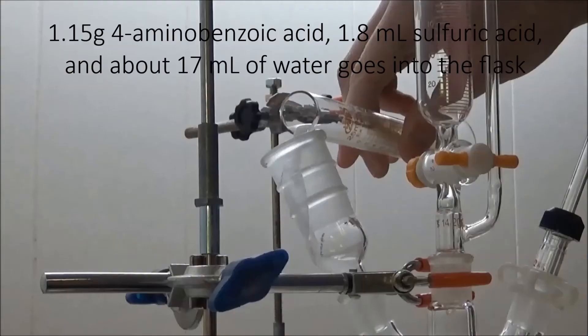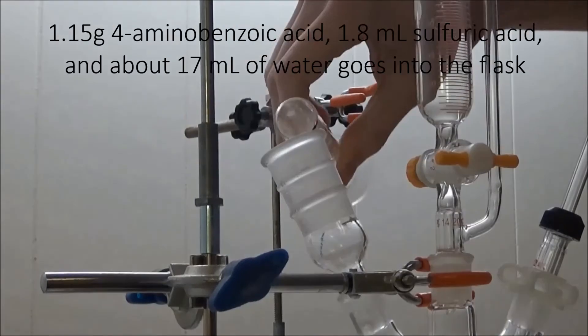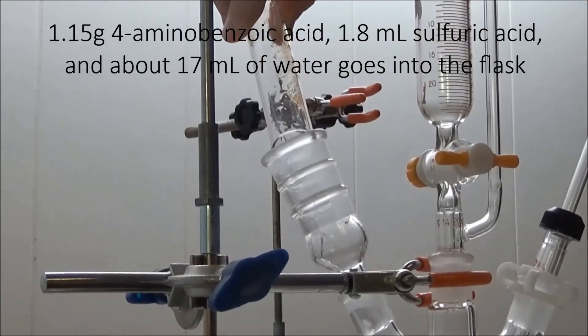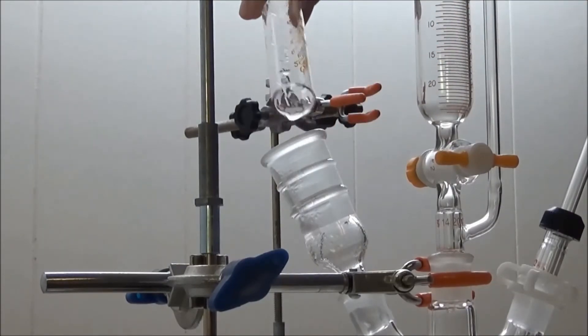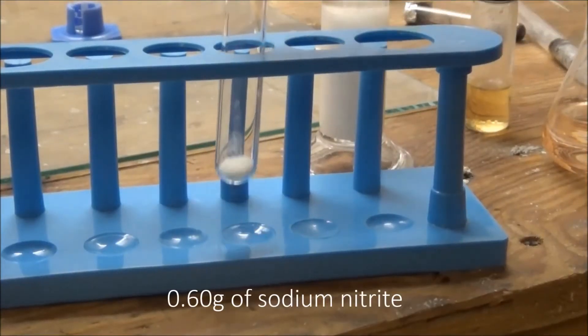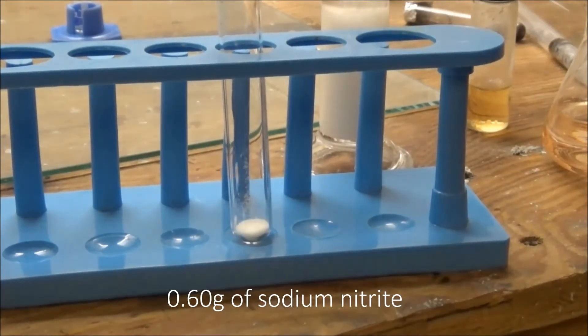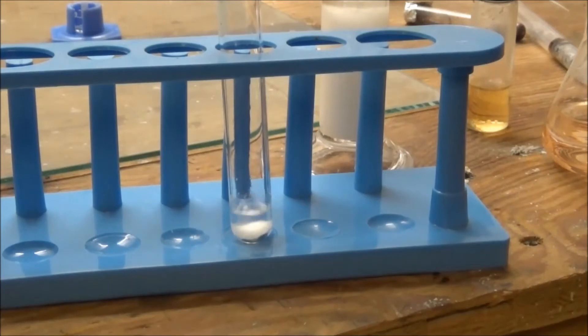I added this to a 50 milliliter three-neck flask and washed it down with some water, bringing the total volume up to around 20 milliliters. I then measured out 0.6 grams of sodium nitrite in a test tube and added about 2 milliliters of water to dissolve it.